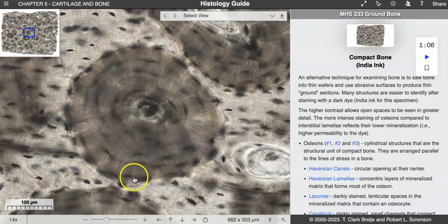So if I were to circle out and put up a peripheral border here, that would be the entire osteon. So everything that's within this tree ring unit is an osteon. The central area here is what we refer to as the Haversian canal or the central canal. I use both terminologies. And this is where we would have vascular flow.